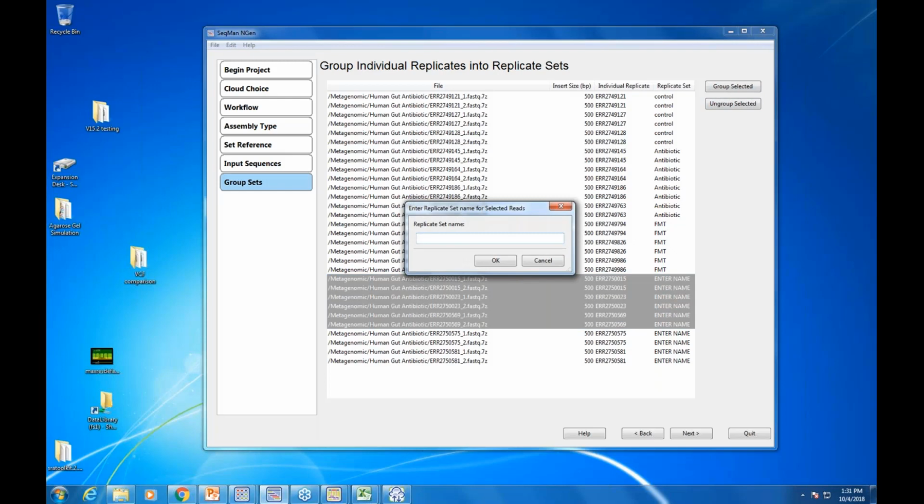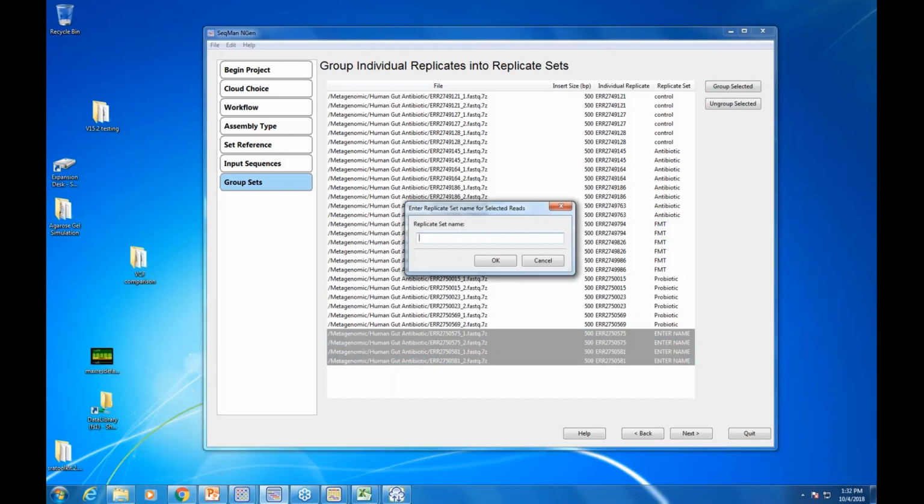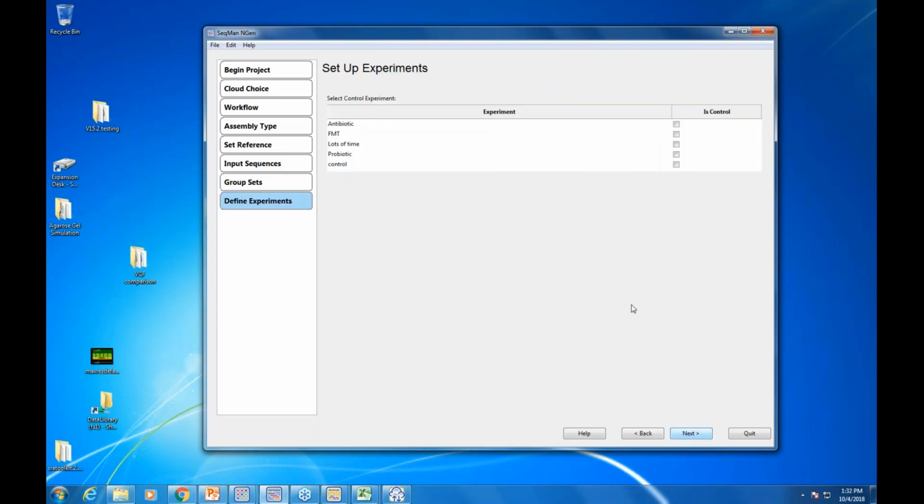And this was probiotic treatment. And then finally, no special treatment, just lots of time. I don't recall exactly how long. It seemed that it was several weeks' time. Does it just reestablish on its own after the? So that's how you set up a larger experiment now. Replicates with multiple, and there's no real limit to how big this can be. It can handle a lot.